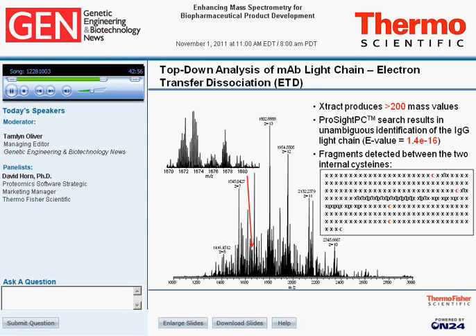And then we did one extra kind of interesting thing where ProSightPC has a mode called, quote-unquote, disulfide mode. And disulfide mode assigns a 1 Dalton negative mass defect for each of the cysteines on the sequence. So if we have a disulfide bond between two cysteines, fragments that contain that disulfide bond will be 2 Daltons smaller than would be otherwise. So in this case, you see a fragment map in the inset, and all those fragments are in the middle of the sequence, and every one of those contains a quote-unquote disulfide modification.